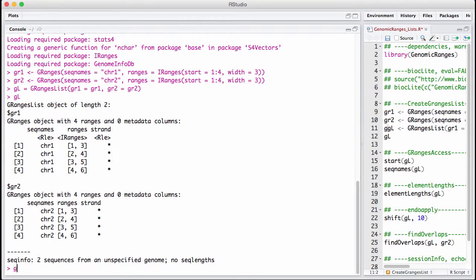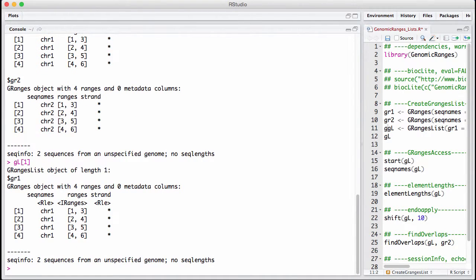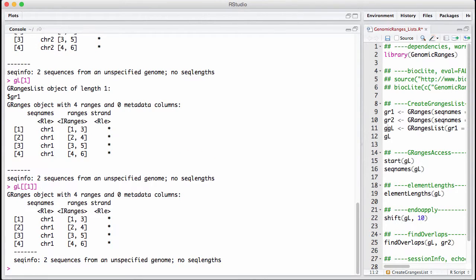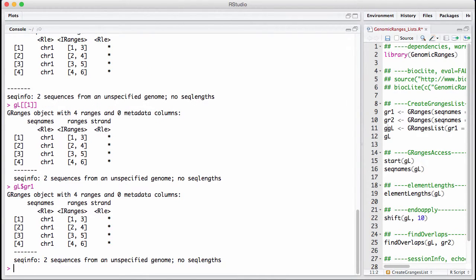It looks and feels a little bit like a list. We can subset it with the first one, which is a gRangers list of length one. We can use the double bracket as we know from normal lists. We can use the name and all the usual things from lists.